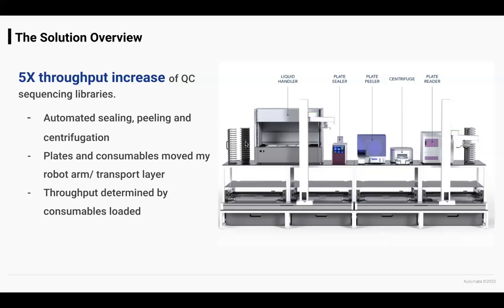It's just adding at the beginning, and then a user can come and take the completed samples out. If they want to keep the quantification plates for any reason, they could be kept in there.